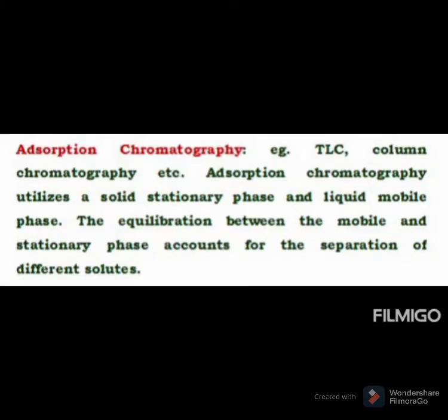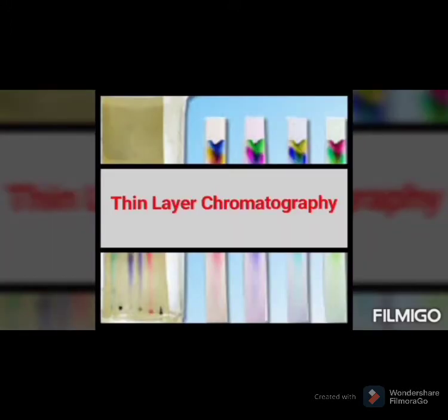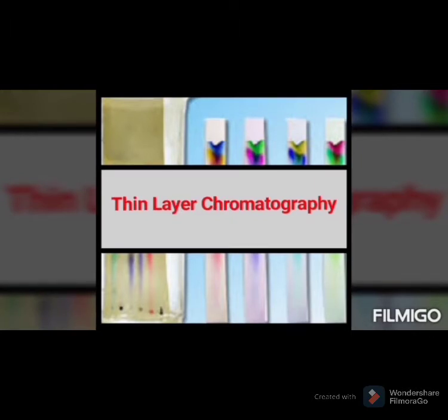Adsorption chromatography utilizes a solid stationary phase and a liquid mobile phase. The equilibration between the mobile and stationary phase accounts for the separation of different solutes. The examples are thin layer chromatography and column chromatography. We can see how thin layer chromatography, TLC, is actually done in a lab.